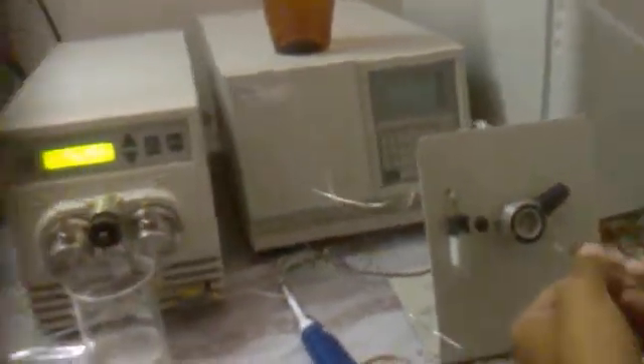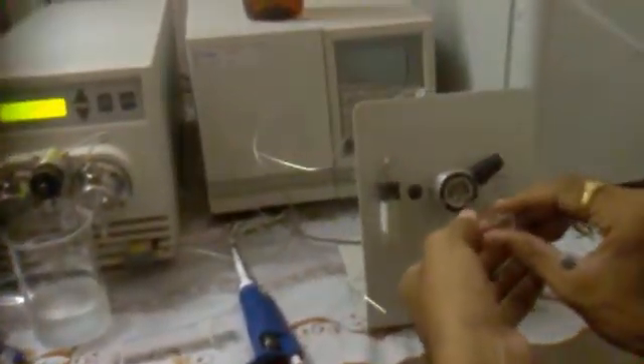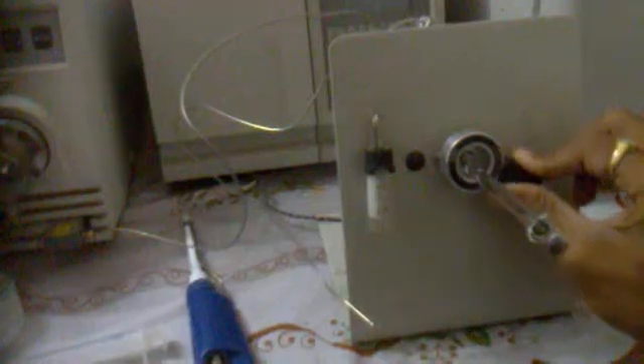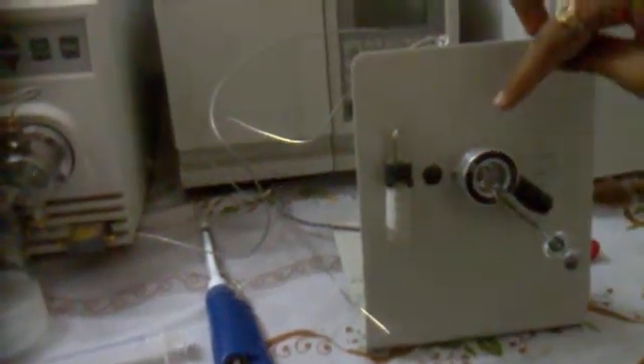Then we go for injecting. We place the loaded syringe into the Rheodyne injector, which is in the load position. We inject the sample, then bring it to inject mode. This means the sample from the loop, which entered from the syringe, is now going into the column.